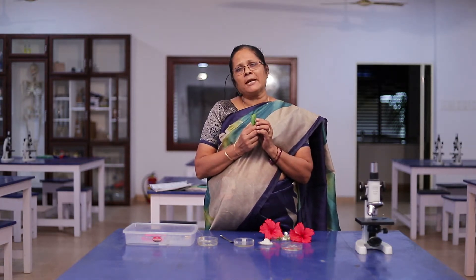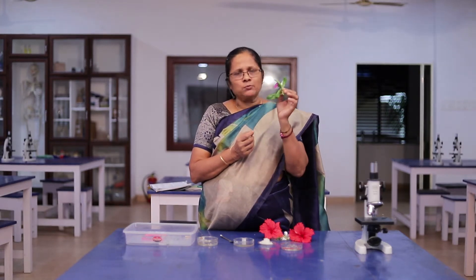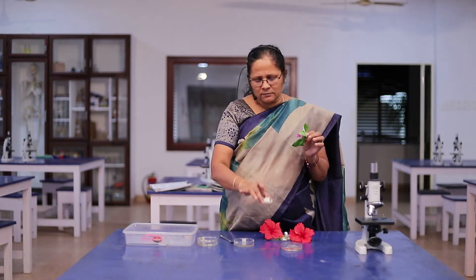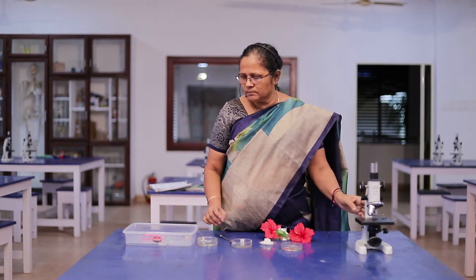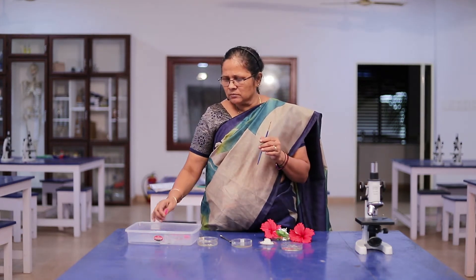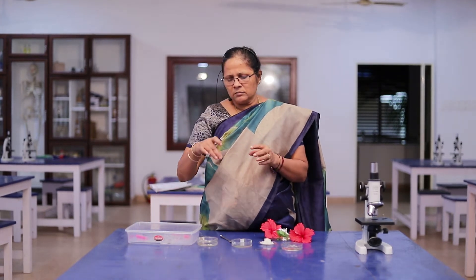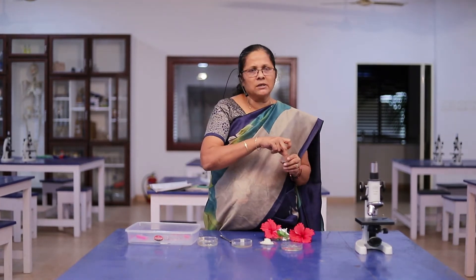To prepare the pollen germination slide, we need this flower — this is Vinca rosea — sugar, water, microscope, brush, needle, glass slide, and cover slip.